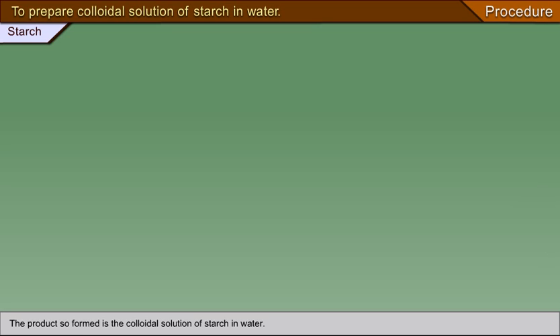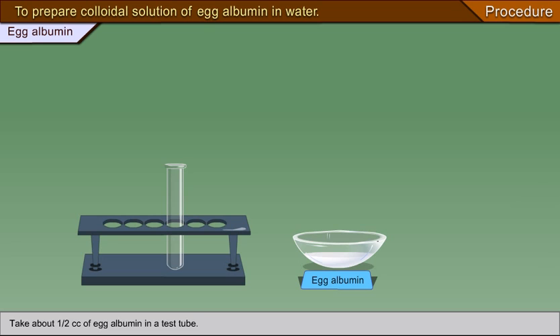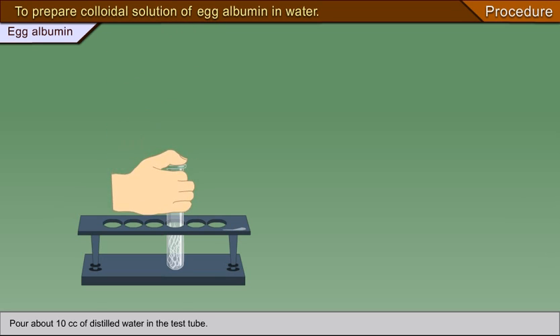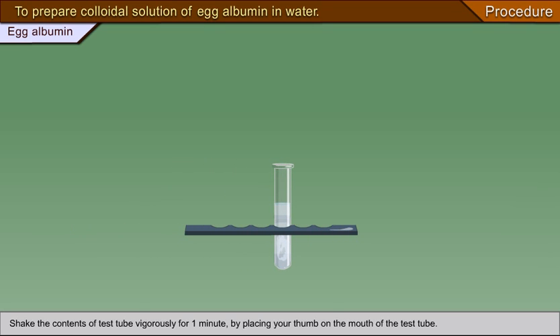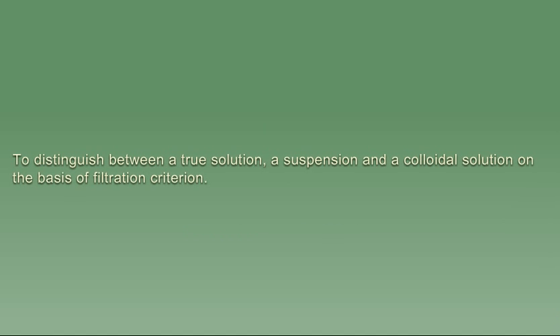To prepare a colloidal solution of egg albumin in water, take about half a cc of egg albumin in a test tube, pour about 10 cc of distilled water, and shake the contents vigorously for one minute by placing your thumb on the mouth of the test tube. You will notice that the albumin gets suspended in water to form a slightly turbid, light milky product. The product so formed is the colloidal solution of albumin in water.